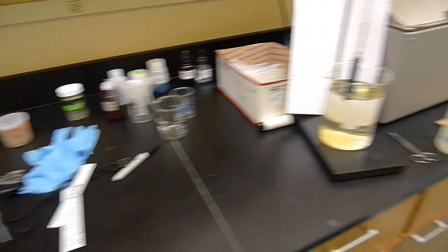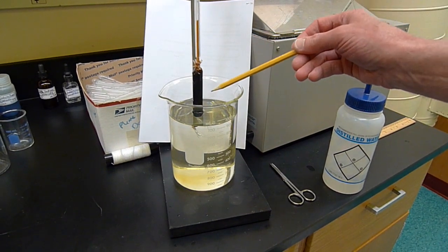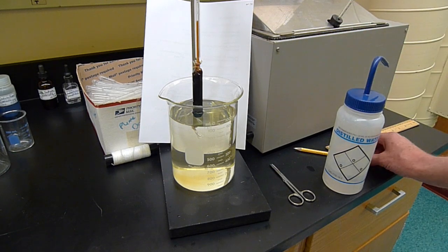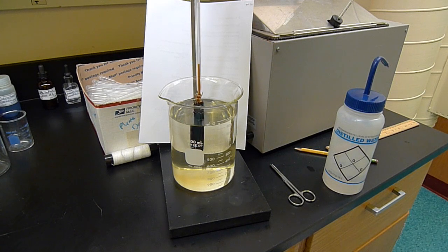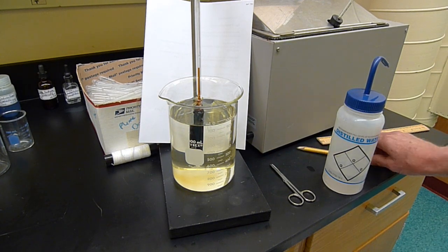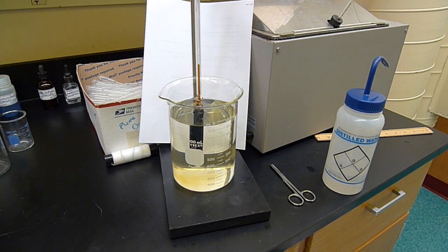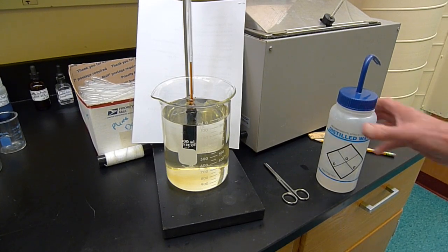So in this particular demonstration, again, we've got molasses in this bag, and you can see that it's being pushed up this glass tube on the inside. If I lower the tube so the molasses is actually sitting in the distilled water, the beaker here is full of distilled water, and there's a little bit of brownish color just because some of the molasses has been seeping into it. So there's just distilled water in the beaker. Again, the molasses is in the bag, that's why it's brown. And molasses is just a really concentrated sugar syrup. So there's an awful lot of sugar in there.